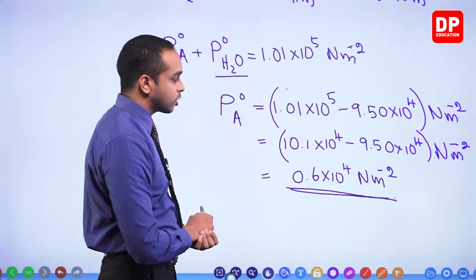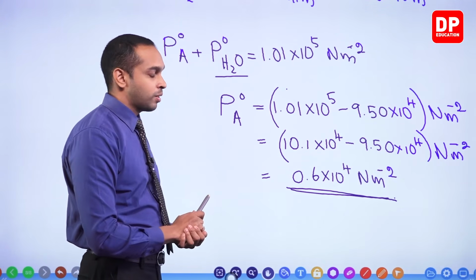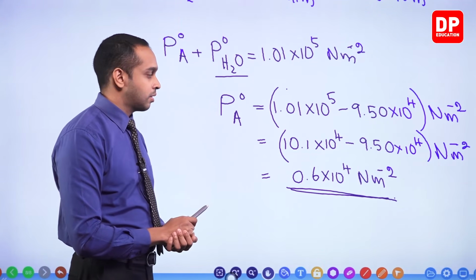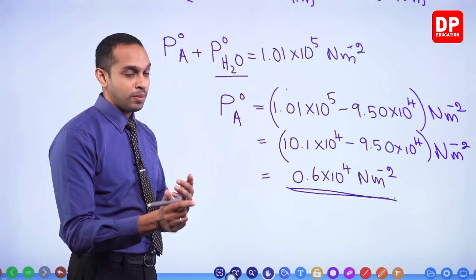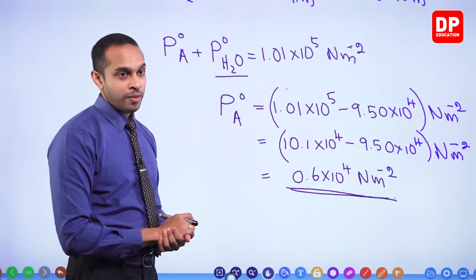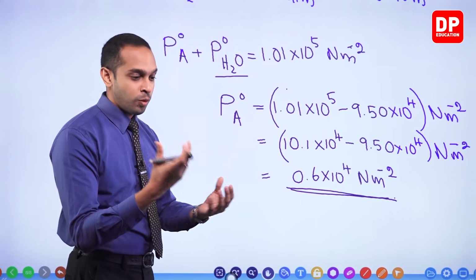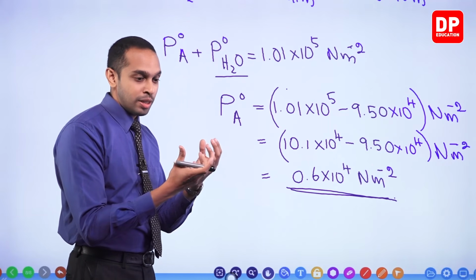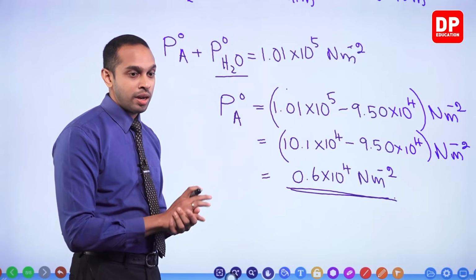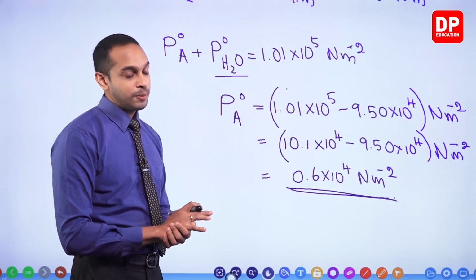Now, at this point, we can use the same equation that we used earlier to get to the mass of naphthalene to mass of water ratio. Based on that, we can develop a good idea about the overall mass of the distillate.